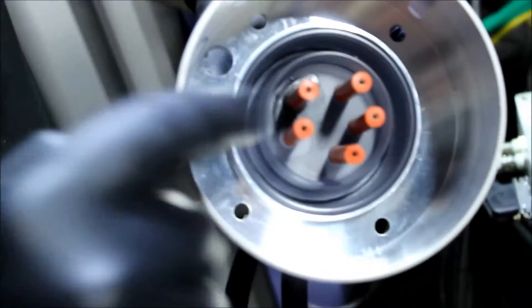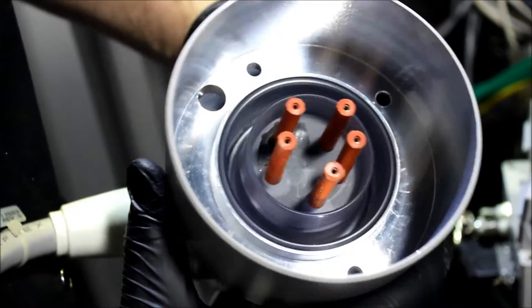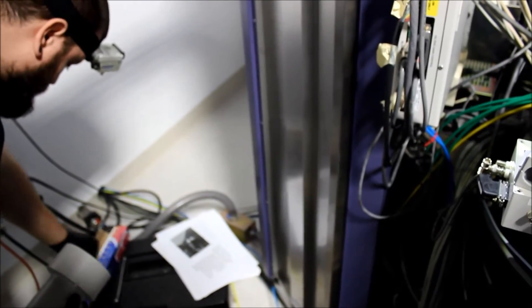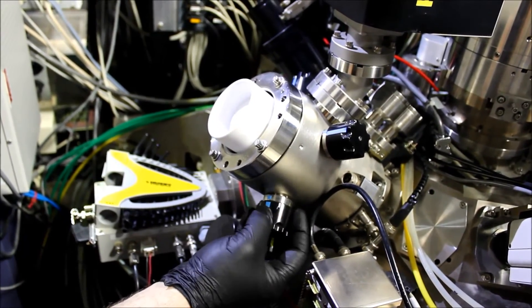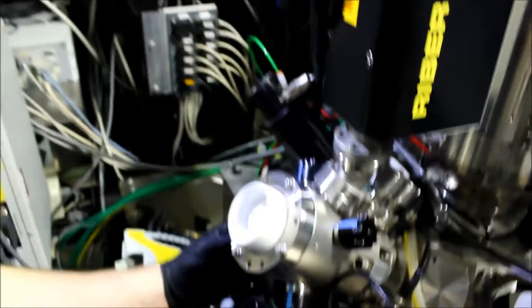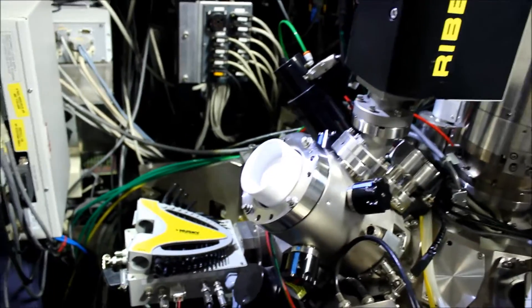These are the high voltage, high tension plugs, and that's what we're disengaging out of this source end here. We want to lay this somewhere clean — we have a little bit of aluminum foil here. Before we get to the next stage, we'll go ahead and unscrew each one of these four knobs one whole revolution. These are the positioning knobs for the LMIS, and we want to make sure we're not grabbing on as we try to take it off. So it's all been unscrewed one revolution.